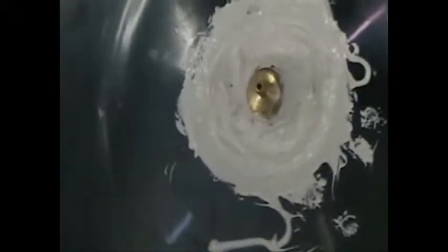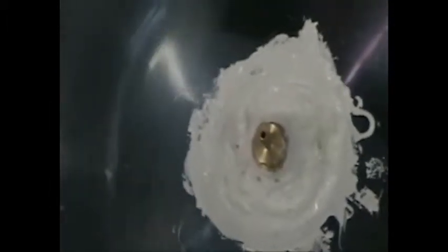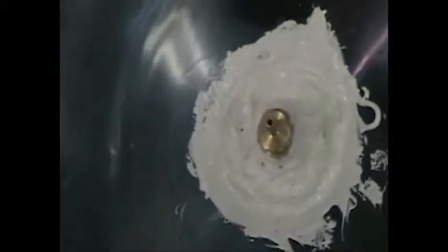As you can see, there's a really nice layer of adhesive, and there's no holes, and when it's done drying, it's going to be completely waterproof.